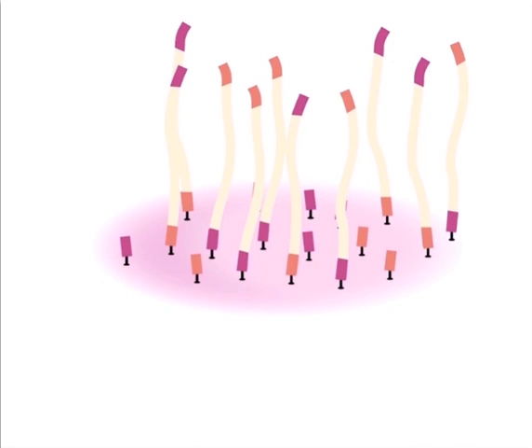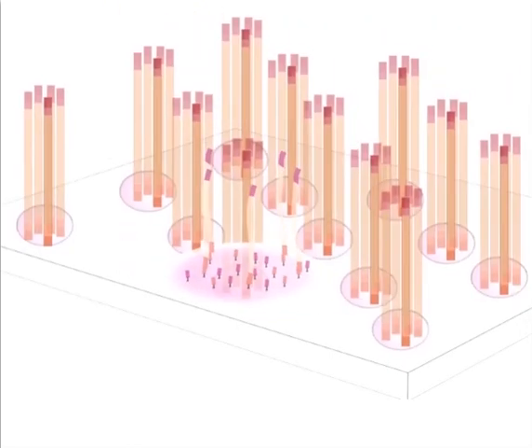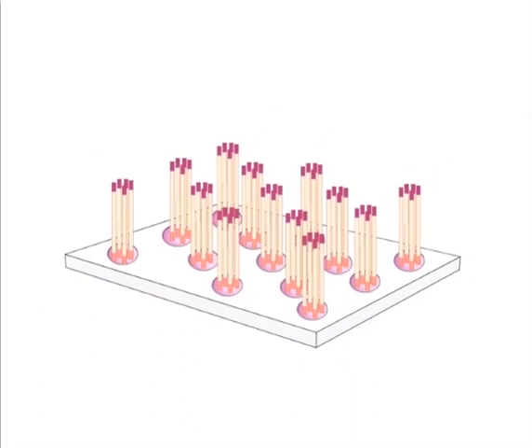These single-stranded DNA molecules represent two sequences that are complementary to each other. Now, one of the strands is clipped at its attached oligonucleotide, leaving molecules of just a single DNA sequence. In this way, tiny islands of DNA form, with each containing many identical copies of a unique DNA sequence. The PCR step produces enough DNA template material for the following sequencing reactions.